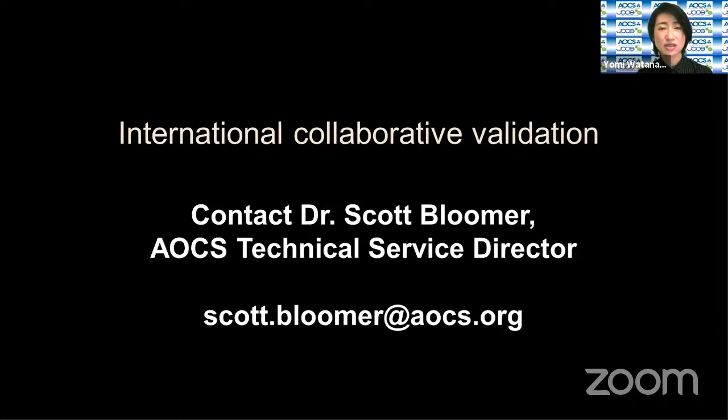International validation is currently planned through ISO led by AOCS. You are very welcome to join the collaborative study. If you are interested, please contact Dr. Bloomer, Technical Service Director of AOCS, who's hosting this session.